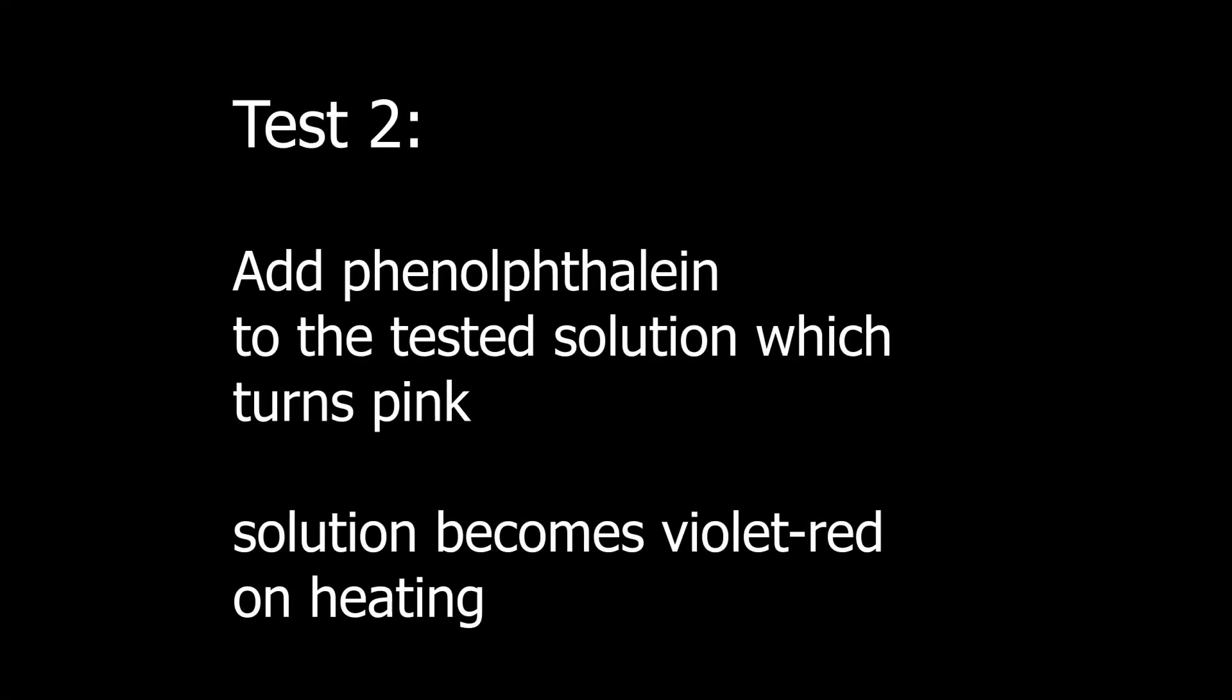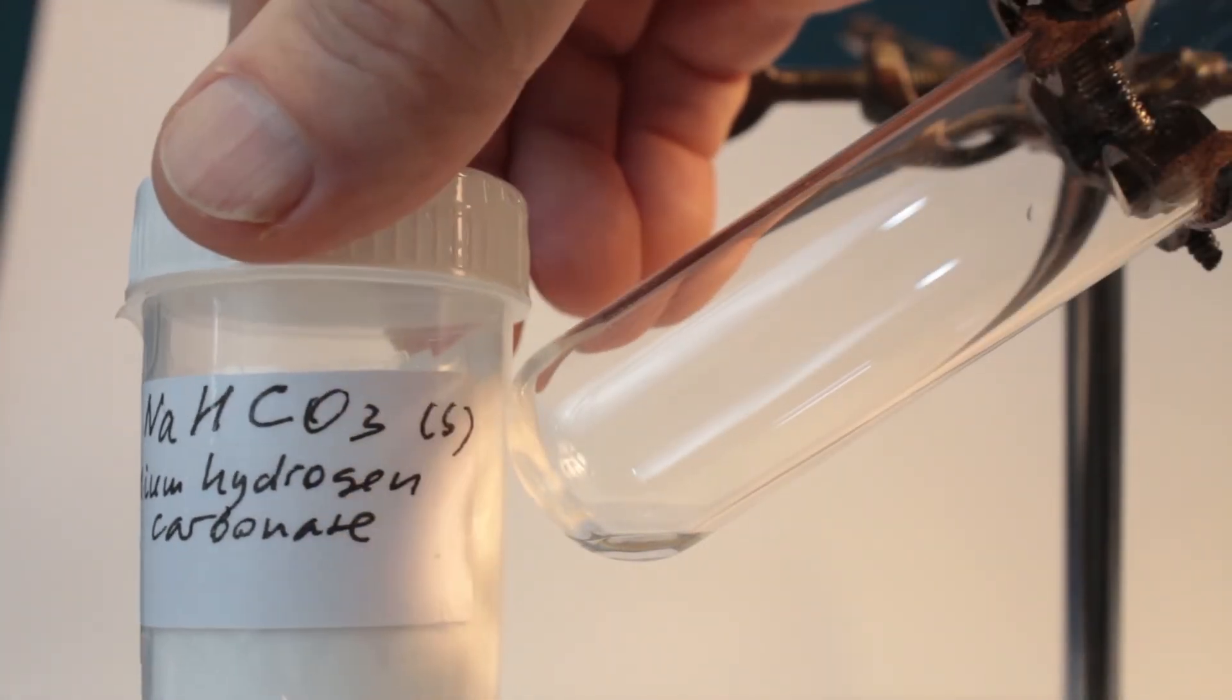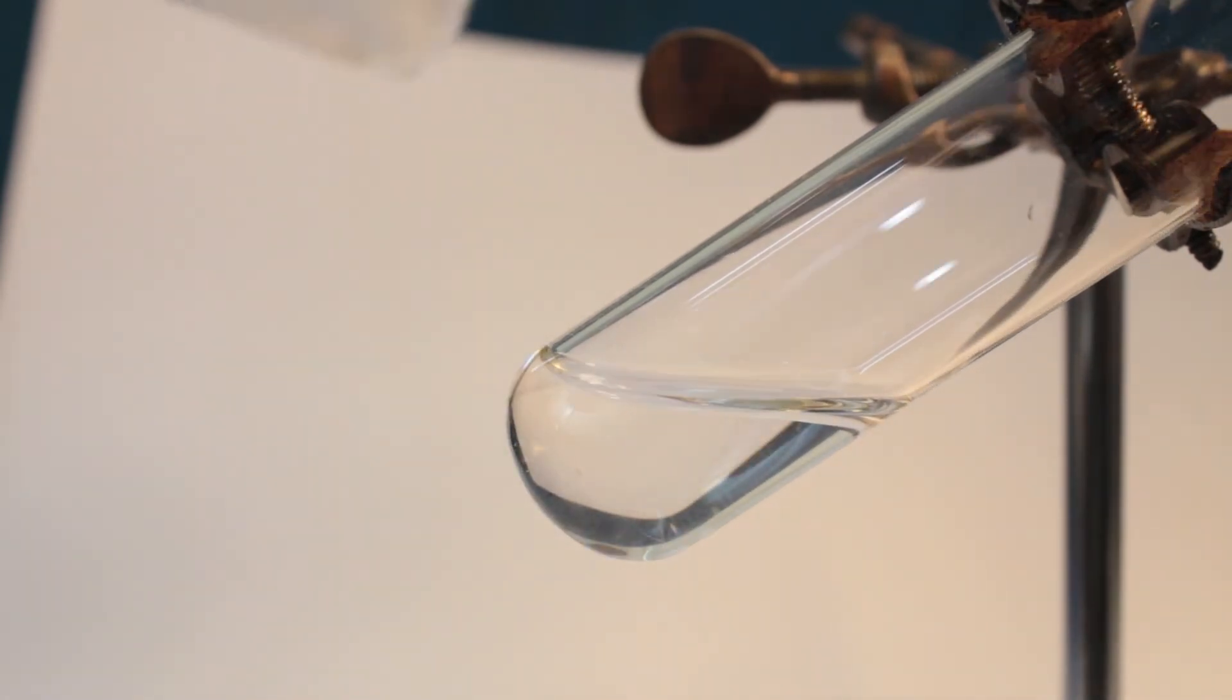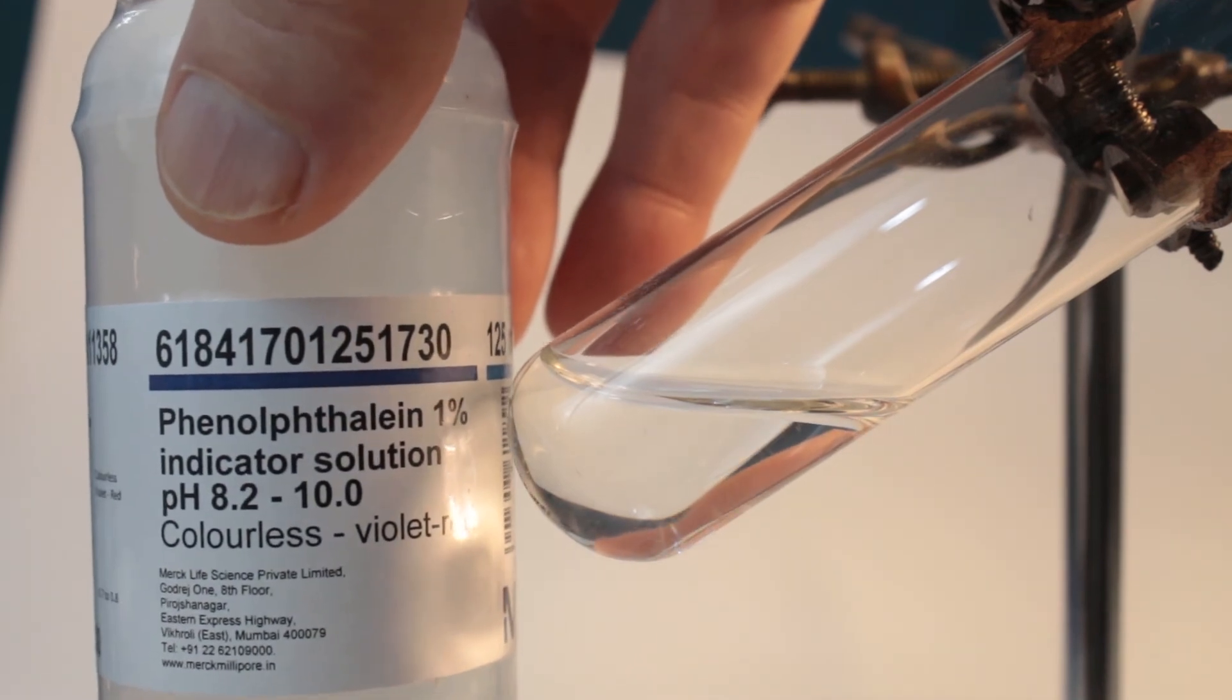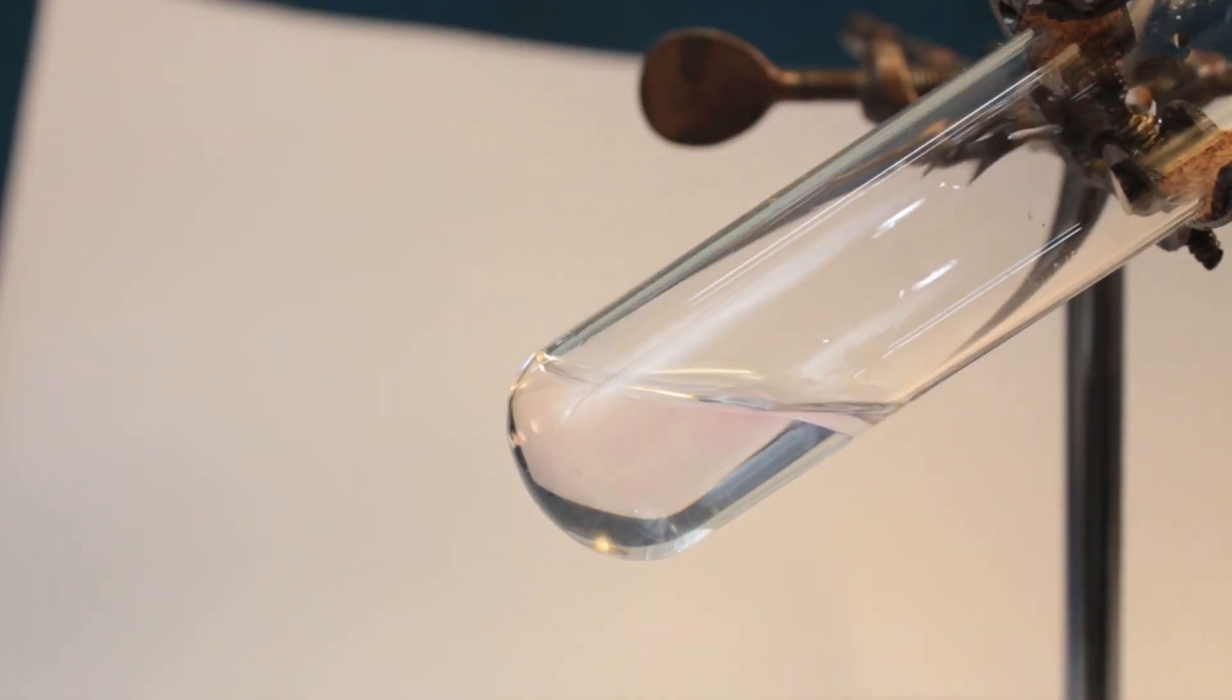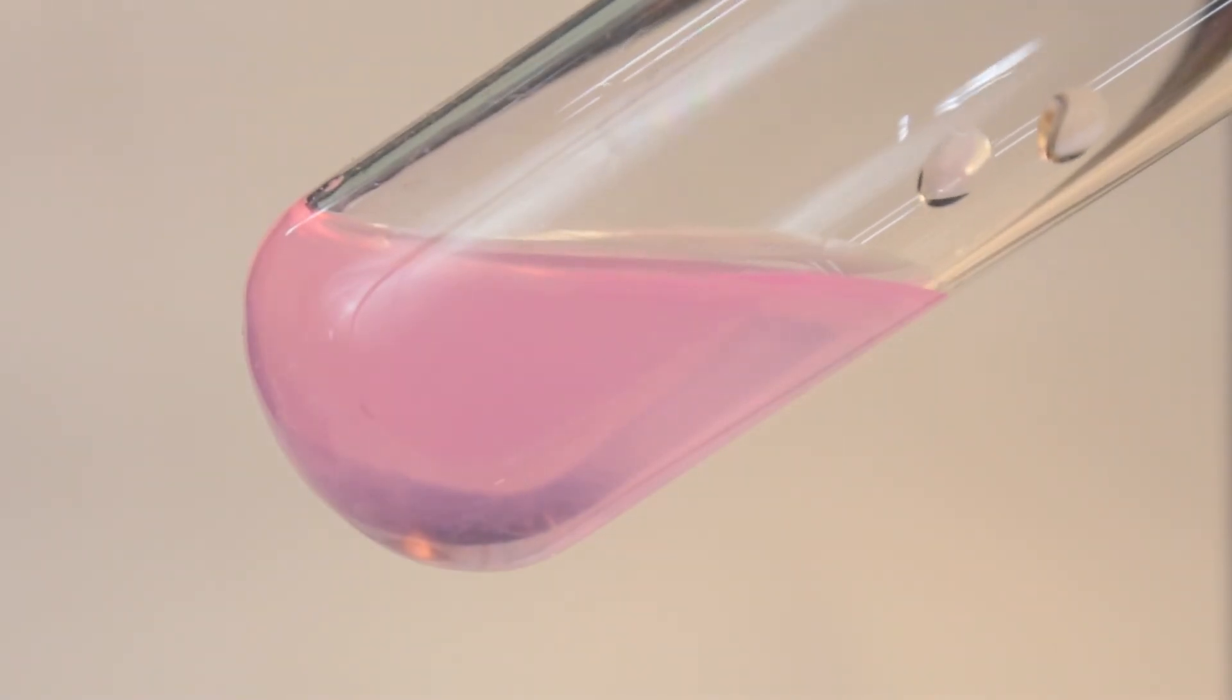Now let's look at second test with phenolphthalein. It's just checking growing pH on heating. For the positive result we use the same sodium hydrogen carbonate. And add phenolphthalein. On addition, solution should be just pale pink. That's part of the test.